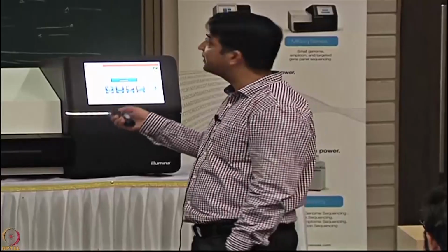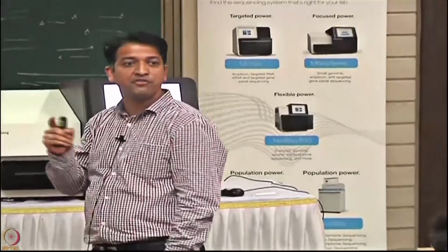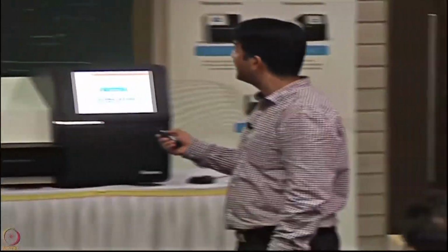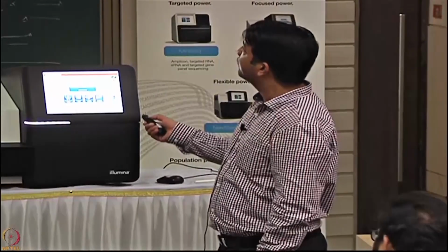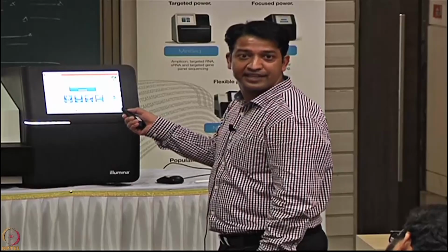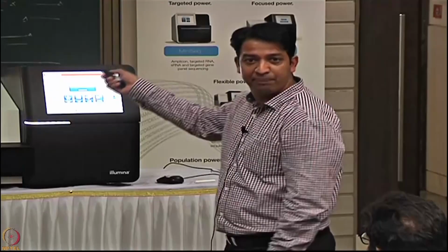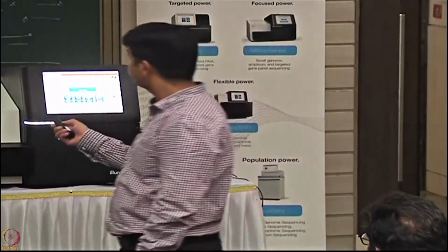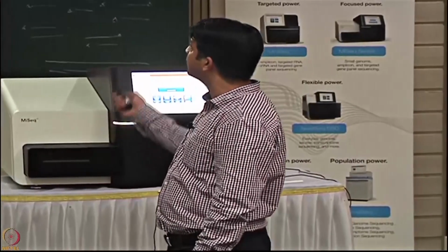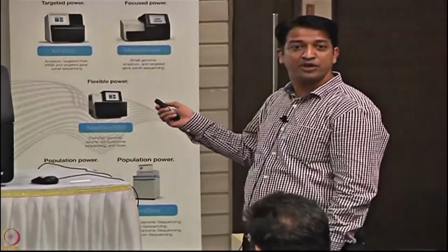Those are detected. Then we denature the product of the read 1 sequencing primer, and we are set to go for paired end sequencing. What needs to be done is, we denature it, and again we deblock this end. Clear? Again, it will flip because we have deblocked the end. And again, you can see multiple clusters will be generated. But this time, we are going to cleave away the forward strand.